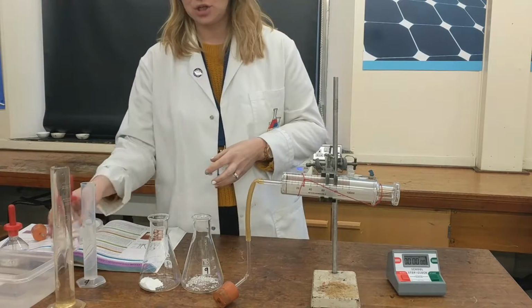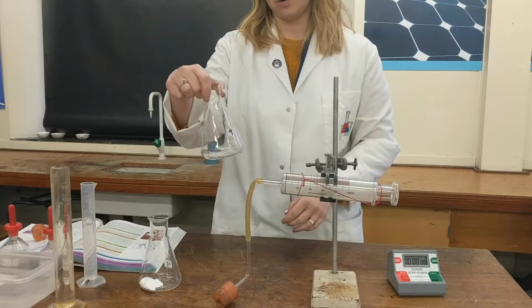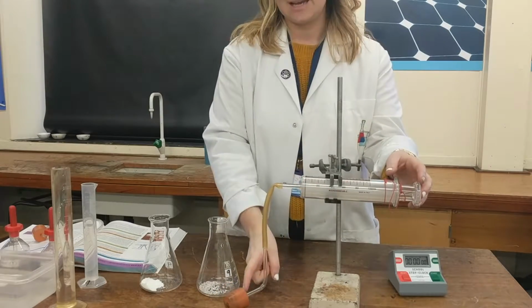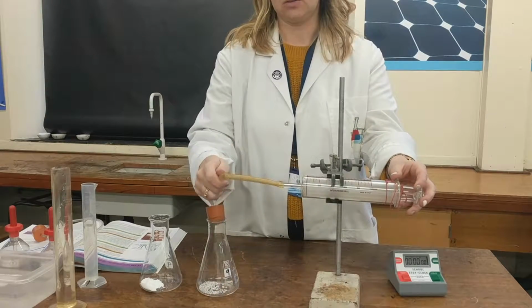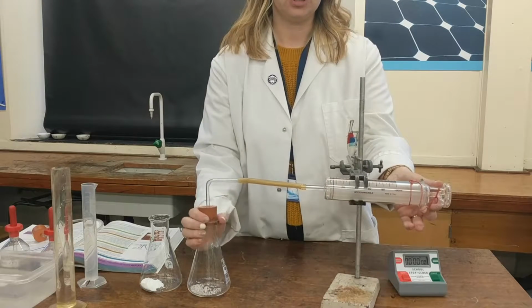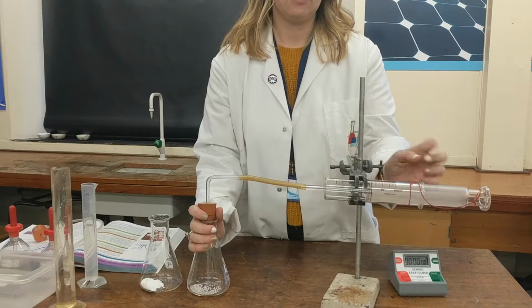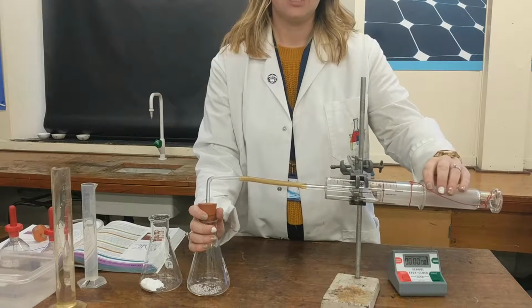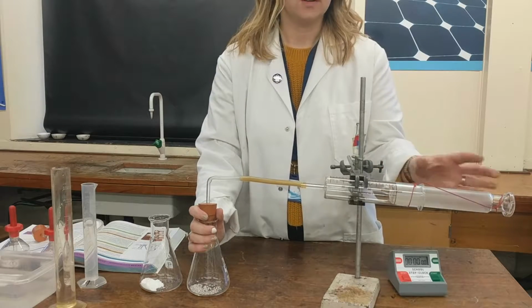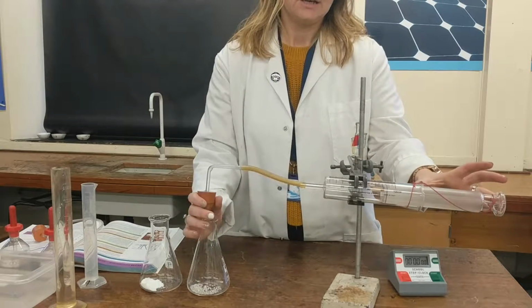So the first one I'm going to show you is the gas syringe. And I'm going to show you this one with the marble chips. Now as gas is produced into the reaction vessel here, when I mix them together, the gas pressure will push the gas syringe out, and you can measure how much gas is being produced as the reaction continues. You will know when the reaction is finished because no more gas will be produced, no more product will be made.